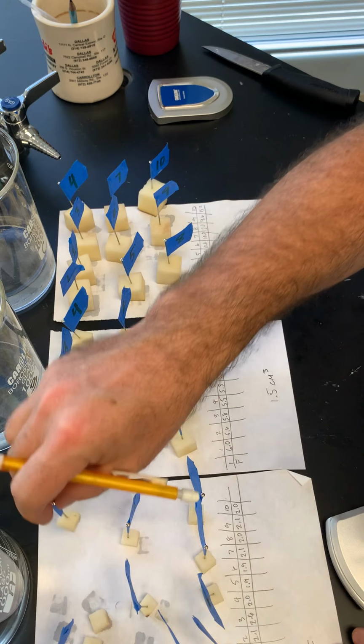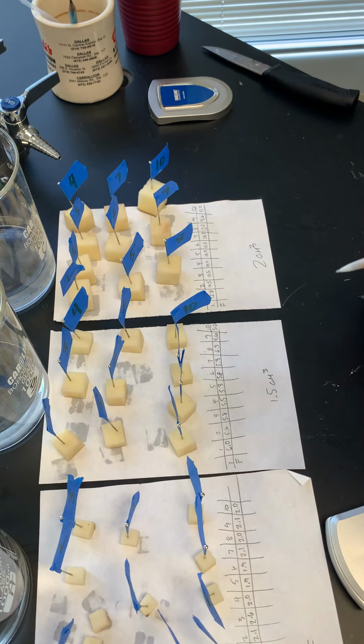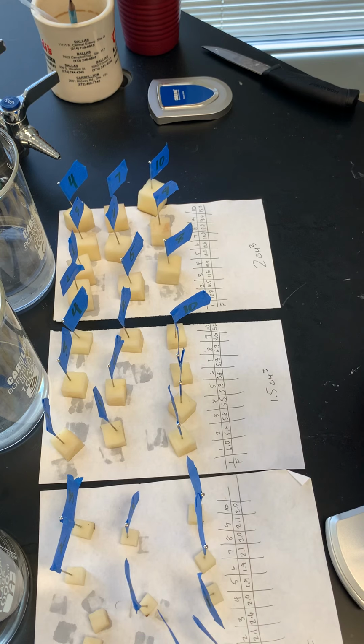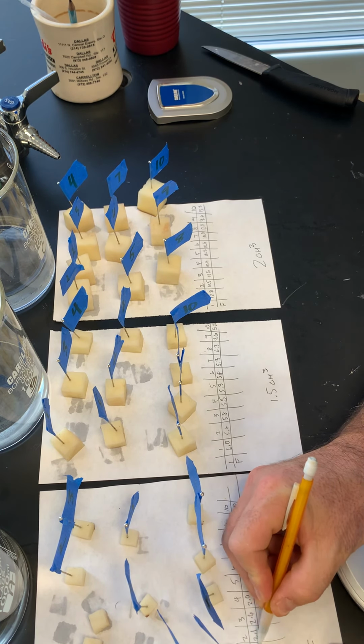That one might have had a little more tape on it. Obviously, I'm taking the mass of the tape and the needle, but that's not a problem because the only place that osmosis is going to be occurring is in the potato. And then 2.3 grams for number 1, 2.3.